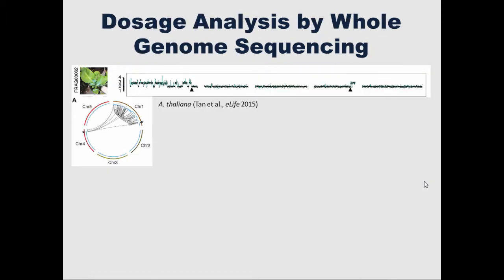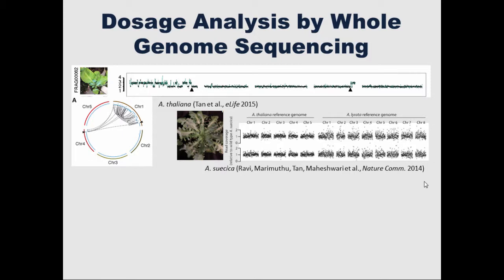And as I mentioned, using the same data that we get, this is actually a shattered chromothripsis chromosome from a population of aneuploids that we've just published on. This is chromosome 1, 2, 3, 4. Arabidopsis have 5 chromosomes. And so we can basically get this sort of data from just one reaction, which is nice.